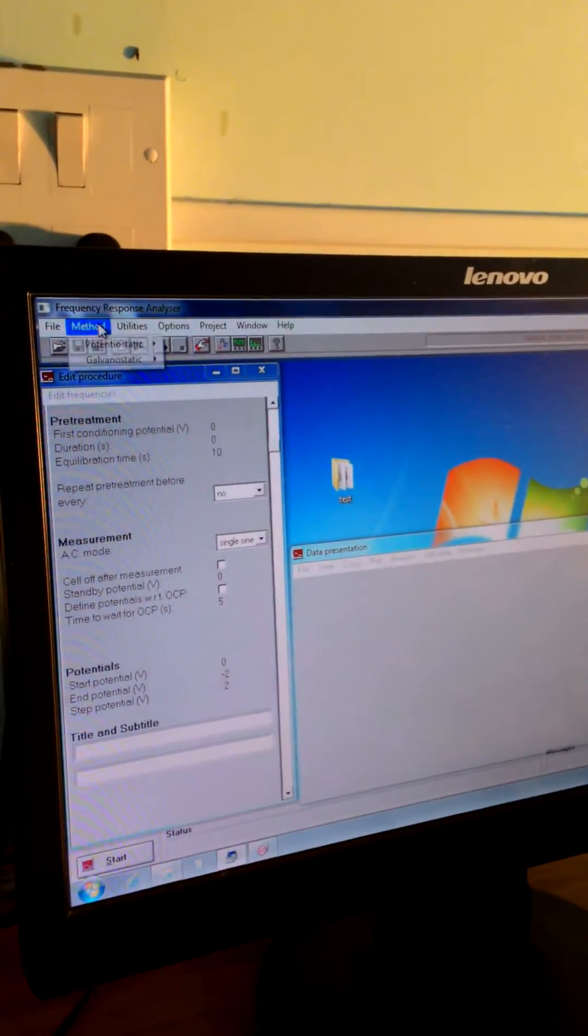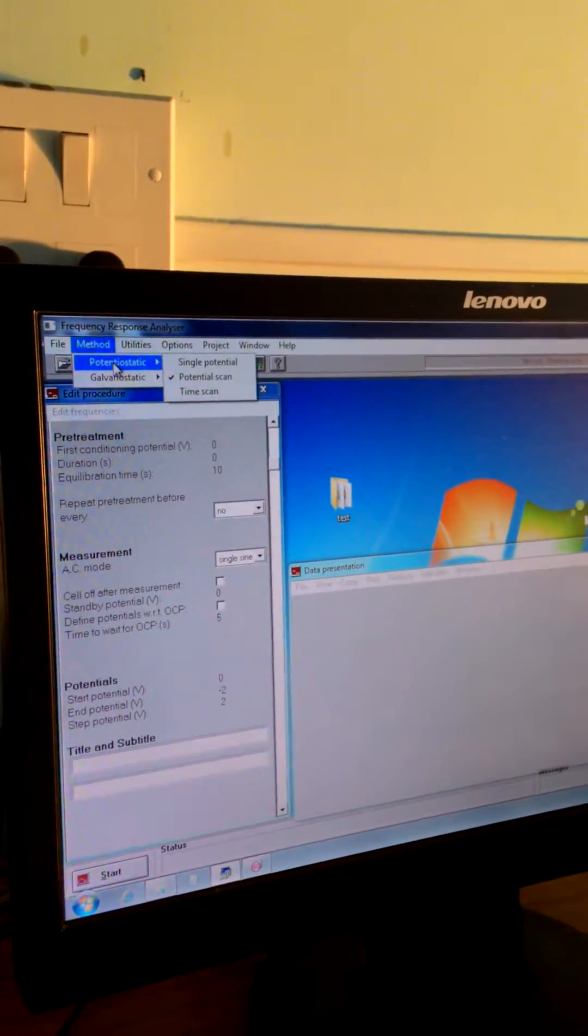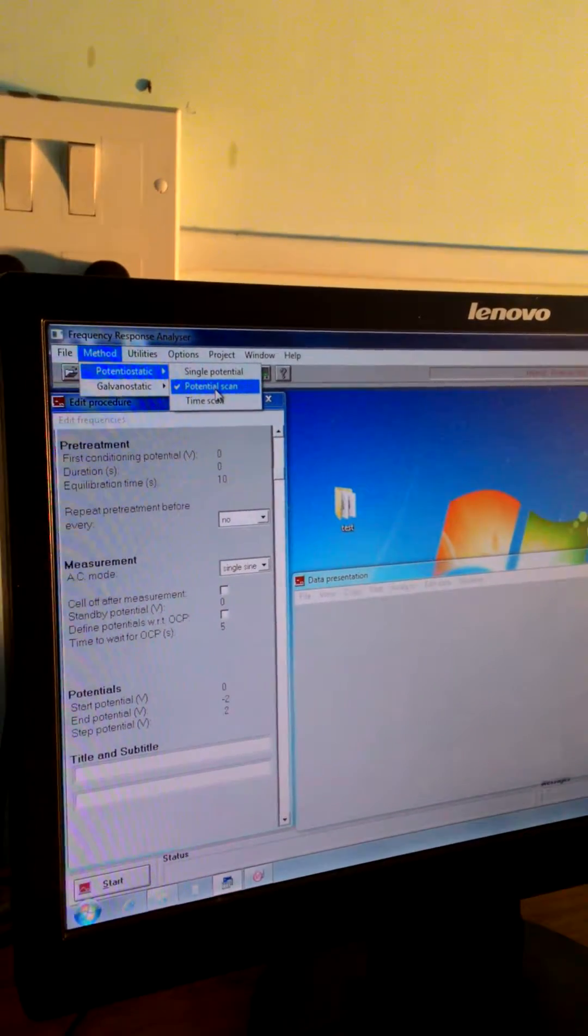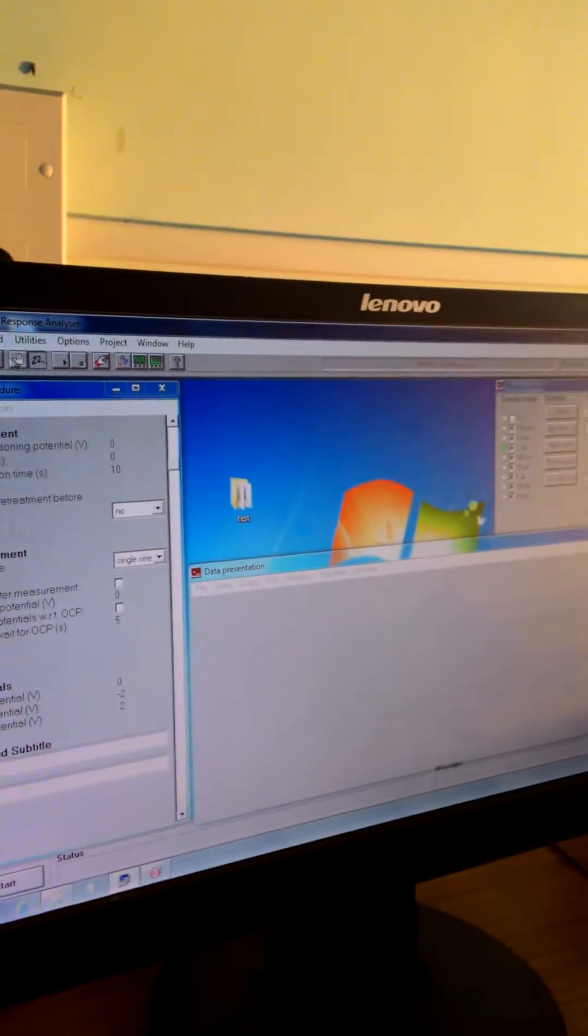Then method, potential static, select the potential scan. Done.